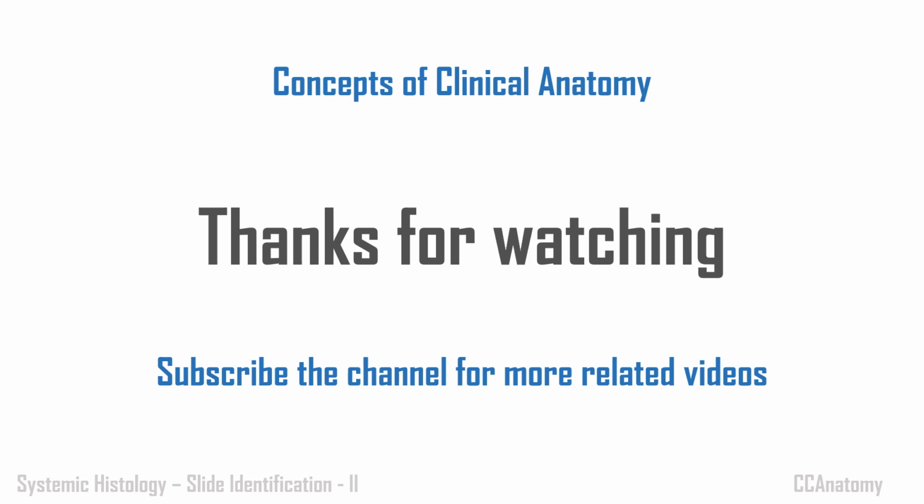When it comes to discussion, take your time and screen all the fields. Screen all the fields and come to a concrete solution, then start drawing your diagram.